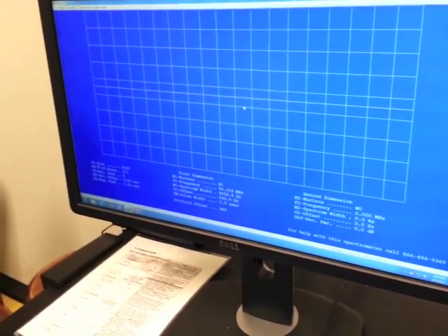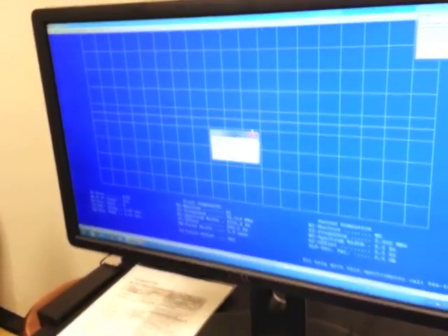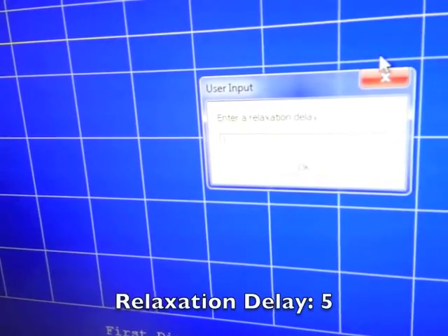Once you've made sure your sample is spinning, come back over to the computer and type in SHIM, hit enter. A box will pop up prompting you to enter a relaxation delay. Because we're using the 5% solution of ethylbenzene, our relaxation delay is 5.